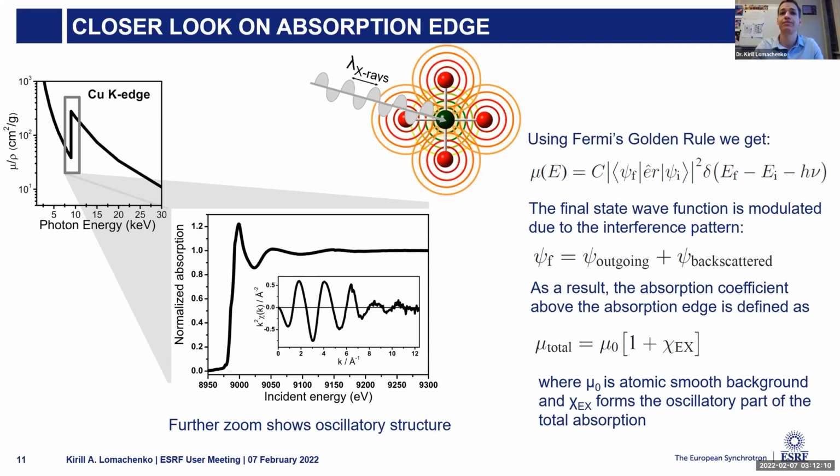And the interference of these two waves creates this oscillatory pattern.